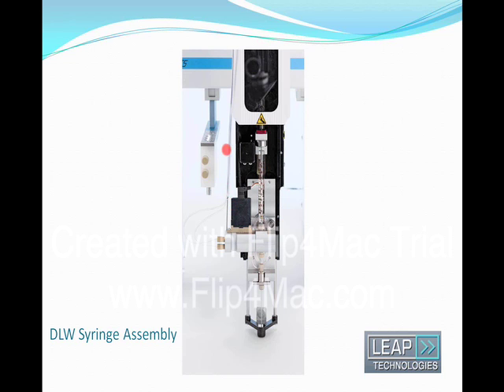You see on the left the support tubing for the solvent lines coming in at the side and the connection of the solenoids goes through the back of this syringe adapter to the electronics of the injection head.